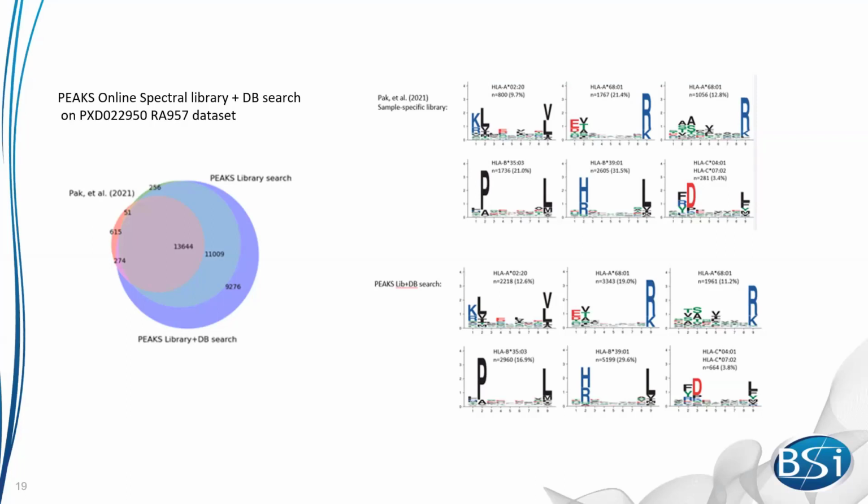Again, you can see those keep accuracy compared to the spectral library only, and this also confirmed our observation. Direct database search helped with deep learning does improve the false discovery rate.